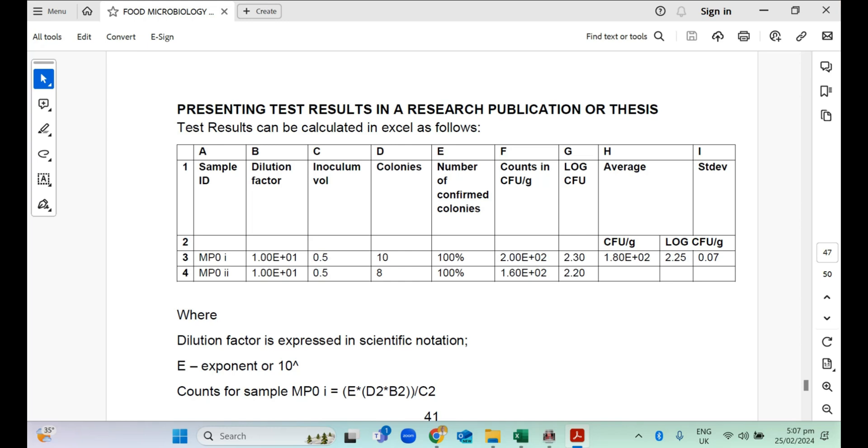The next thing is the number of confirmed colonies. In some cases, in some of the tests, you may go on to do confirmatory tests. The number of confirmed colonies in percentage can also be added to your excel sheets. Finally, you can input a formula which I've explained here and I'm going to practically demonstrate in the video for you to be able to calculate your counts in colony forming units per gram of your sample if it's solid or per ml of your sample if it's liquid.